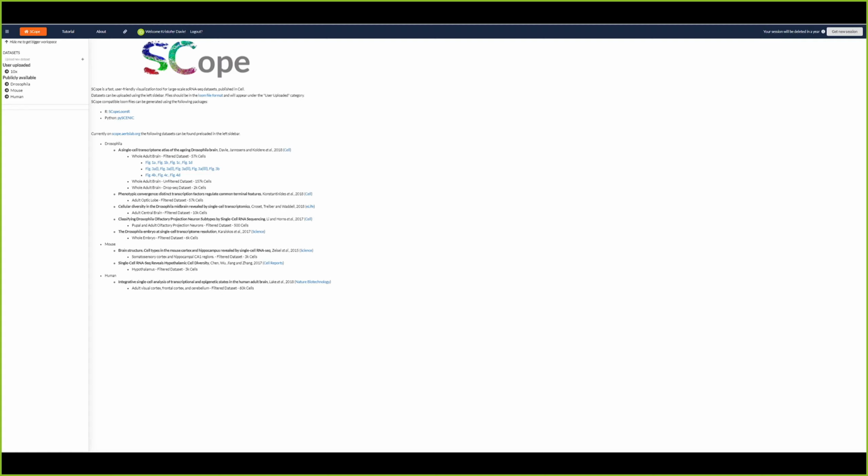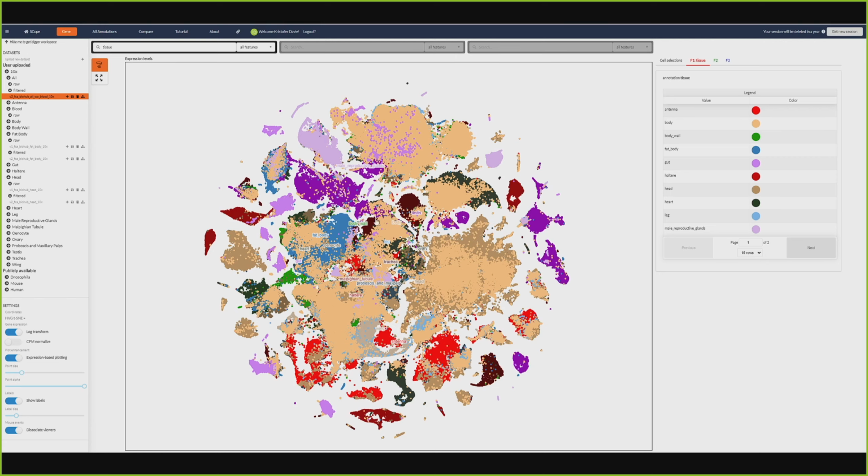This is the plot I showed before. On the right, you've got the legend there with the different colors, and on the top of the plot, you've got the different labels for the different annotations you've got there. And these annotations could be a variety of things. We've got many things in here, including the batches, etc. On top of the annotations, we've also got clusters.